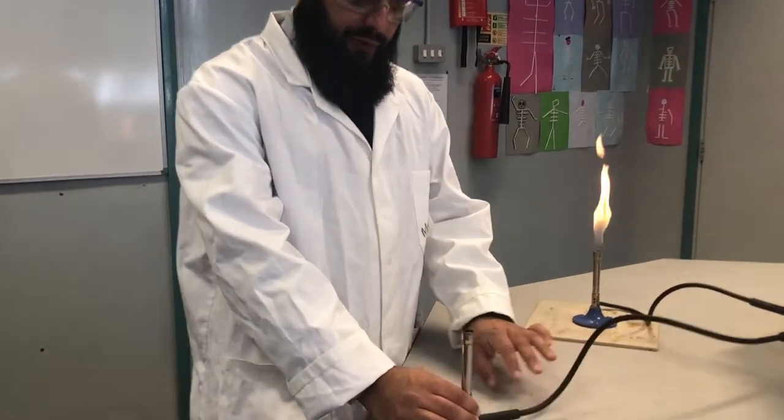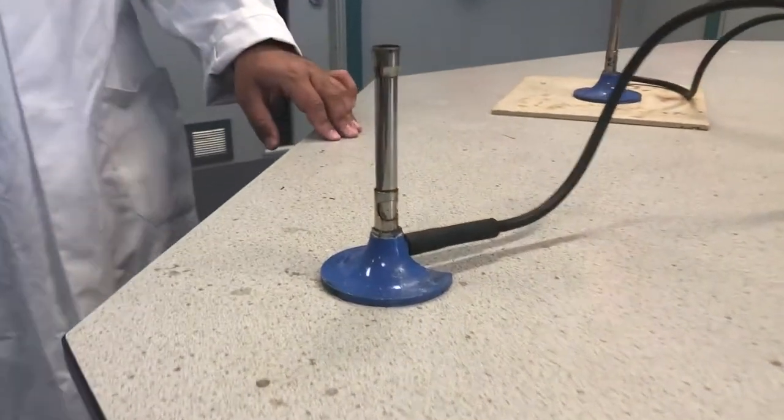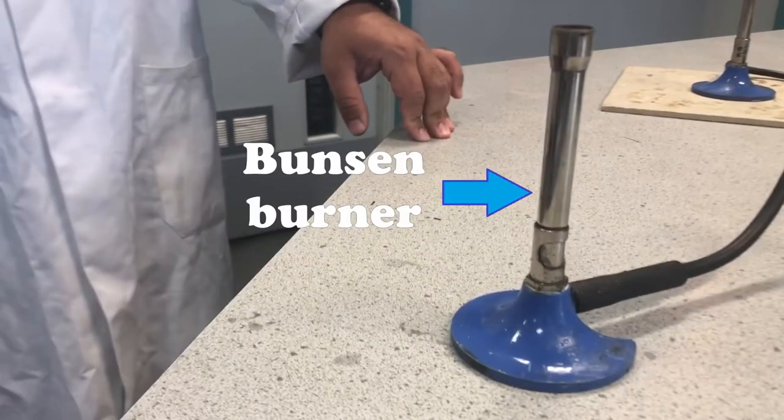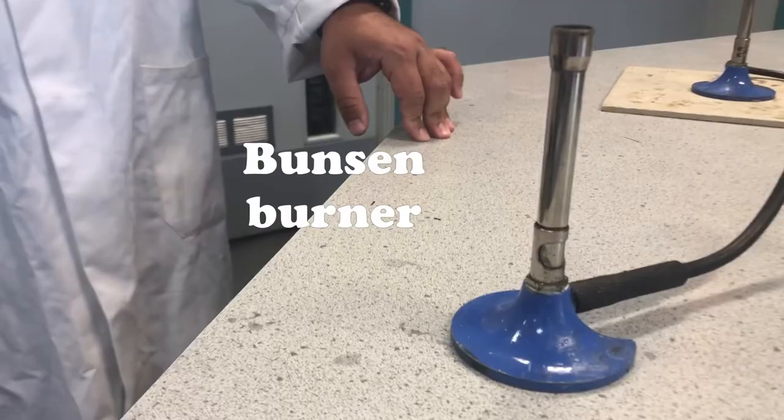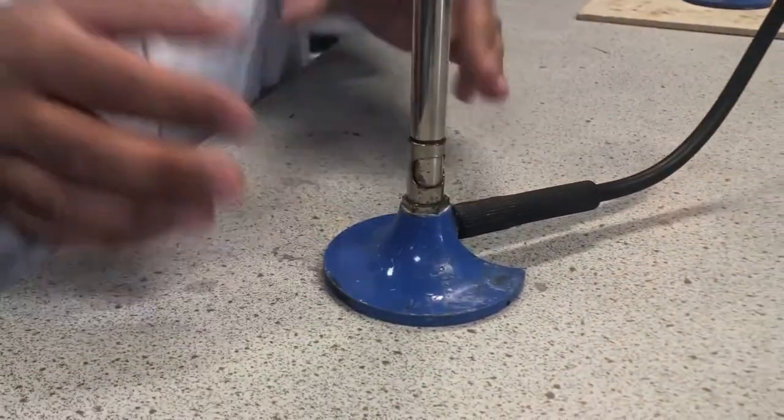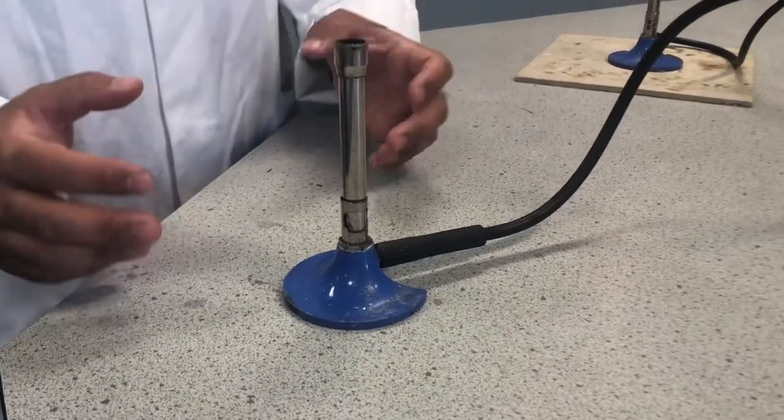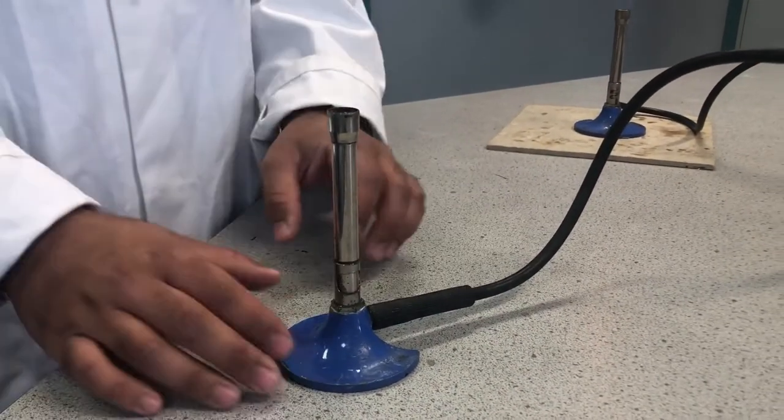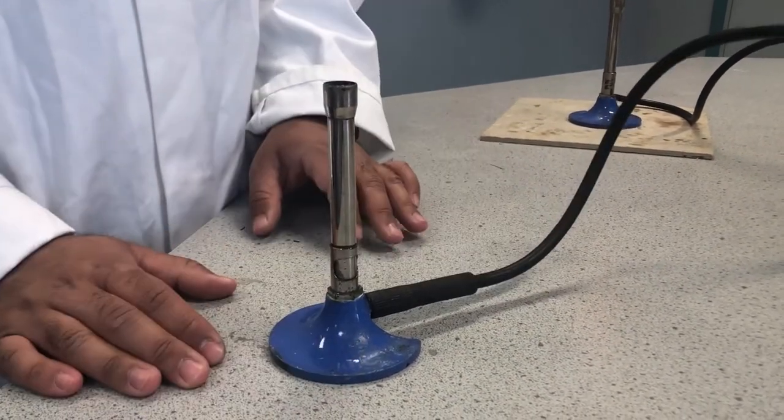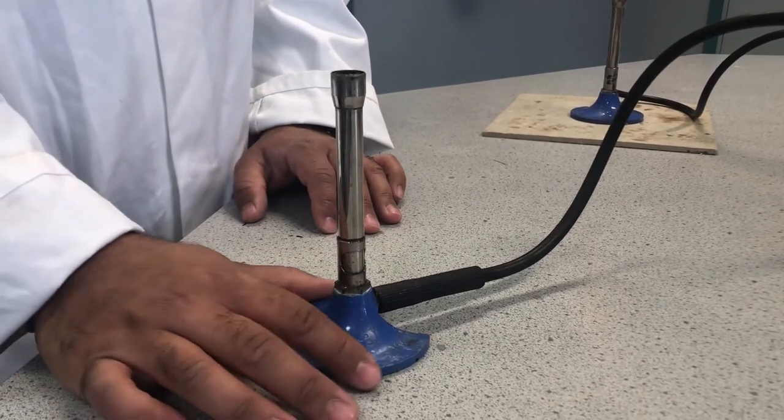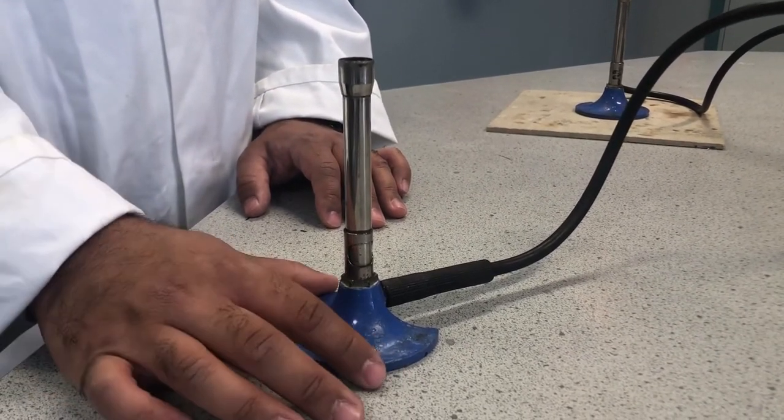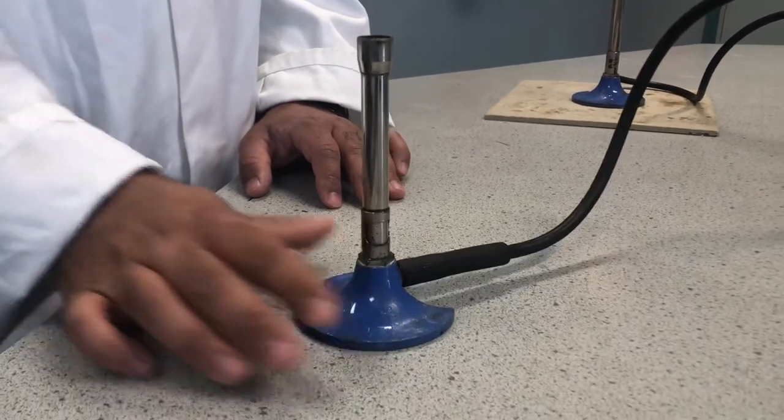So first of all, if we focus on this apparatus here, the Bunsen burner. The Bunsen burner is designed to give us heat in the lab so we can monitor chemical reactions, speed them up. It has certain structure to it that you need to be familiar with. This base is designed to be heat proof. So if you ever need to use the Bunsen burner or move it, you hold it from the base.